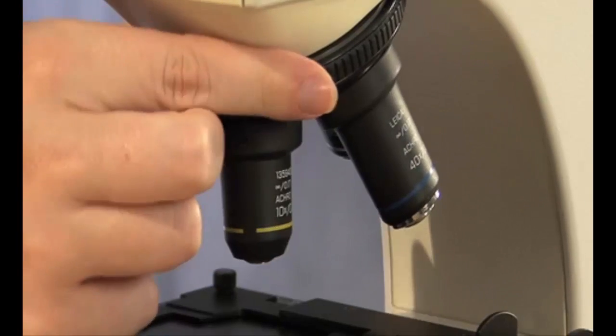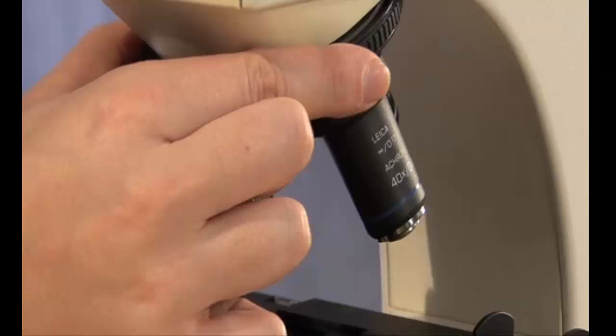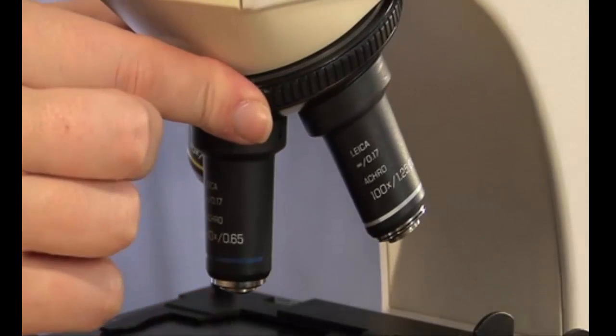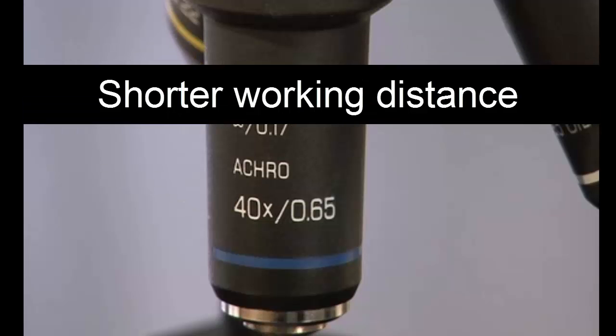Next is the low power objective, which has a magnification of 10x. Next is the high power objective lens, which has a magnification of 40x and a much shorter working distance.